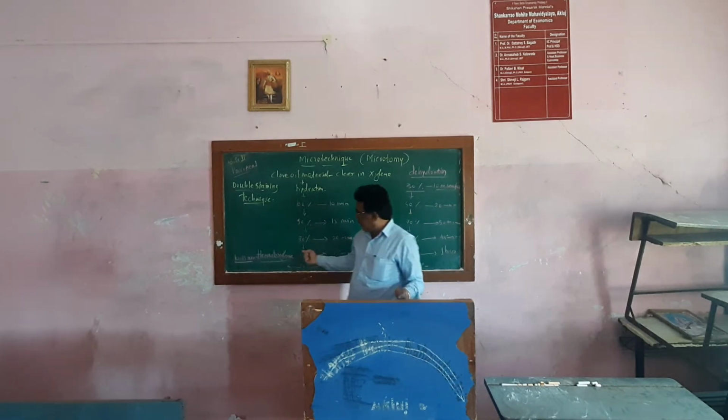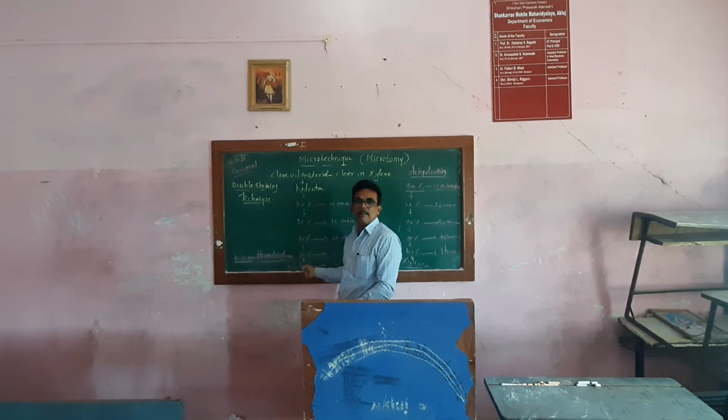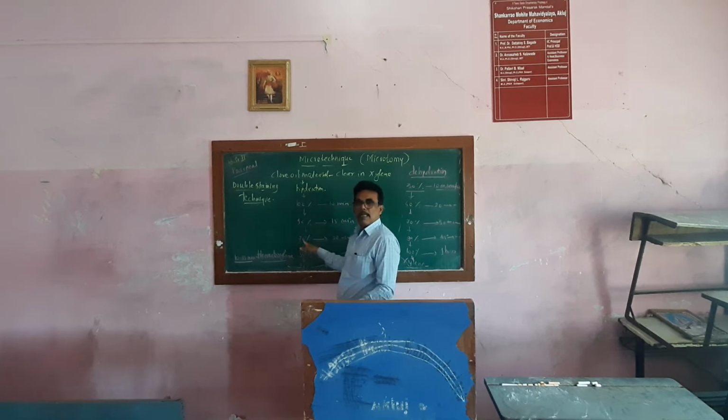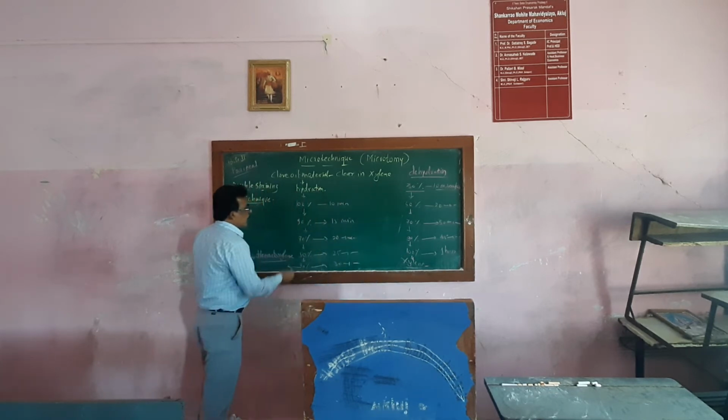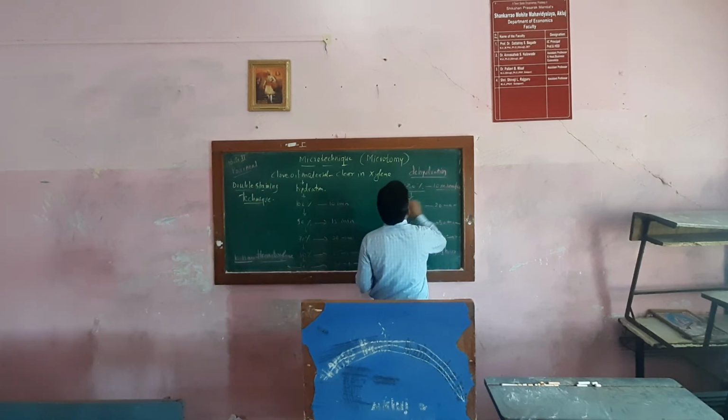Afterwards, you have to remove that and again go to the 30%. Again the next step is 30%, then 50%, then 70%, and then another stain will be added.